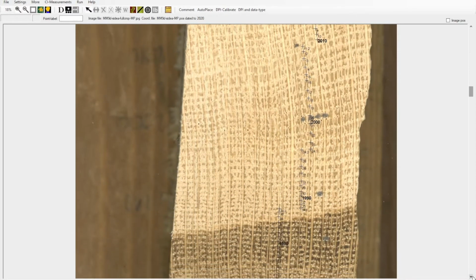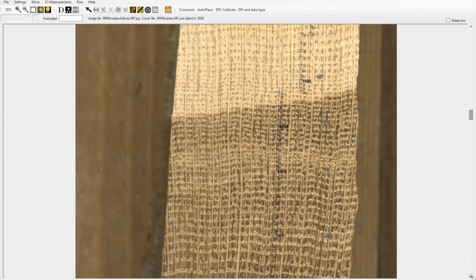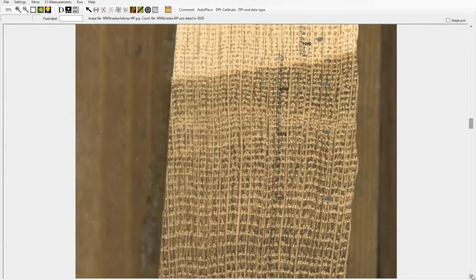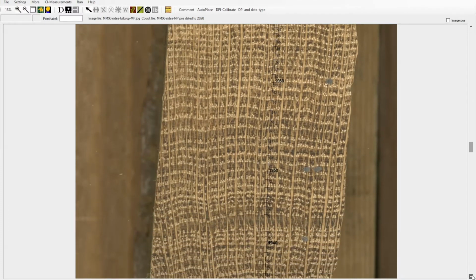Measuring ring widths is important to quantitatively identify marker years such as particularly narrow rings or periods of suppression. These data are later collected from other samples in the area to develop the site or region's overall chronology.